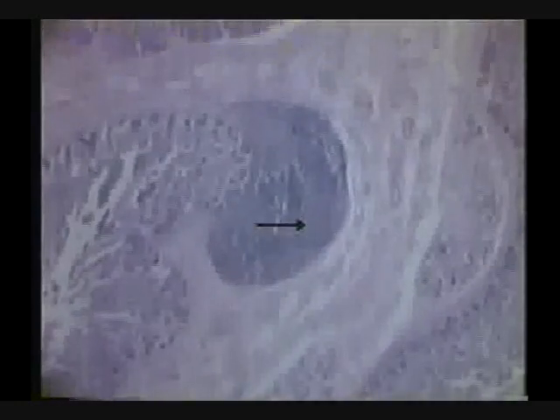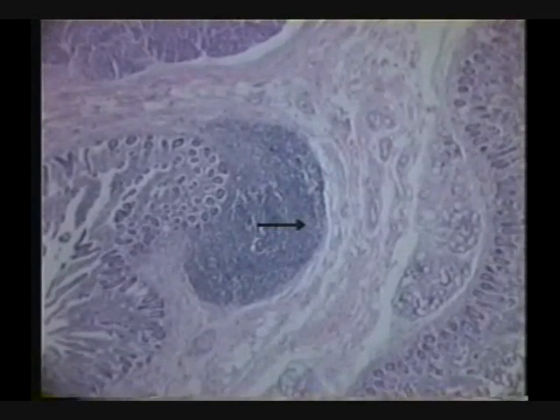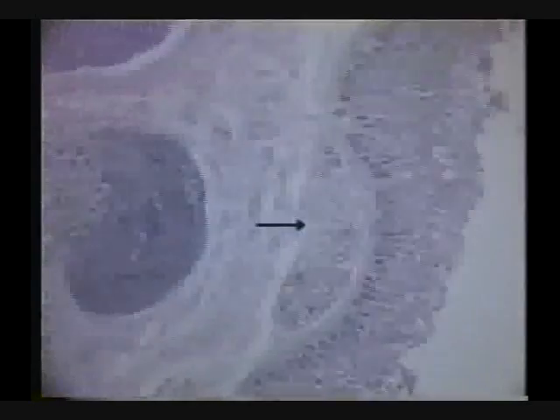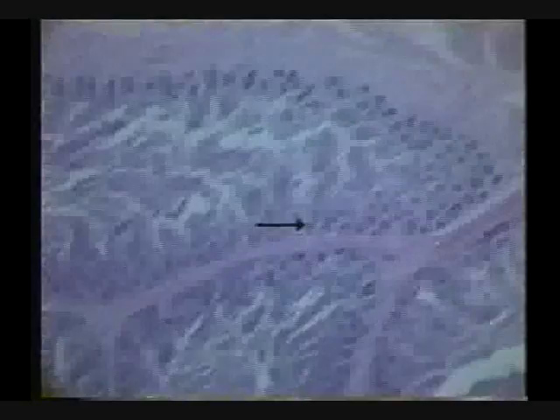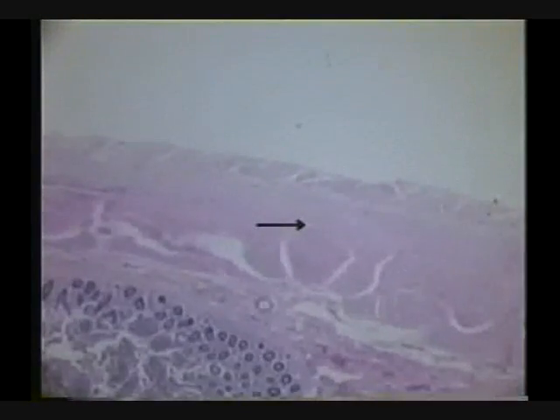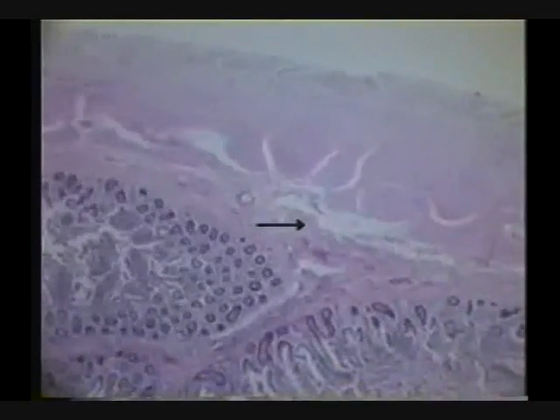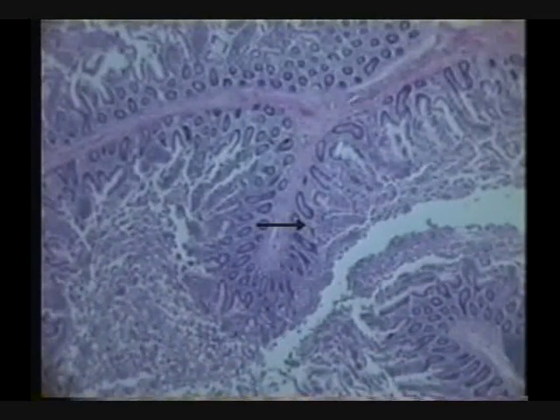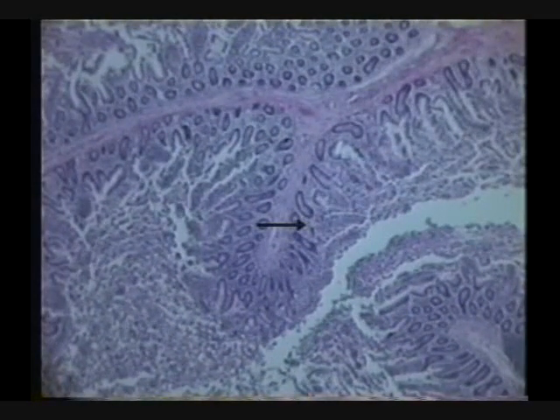If we go back and look, okay, see here's more duodenum. It's all fallen apart. Ooh, what's that? I hear it? Lymphoid nodule, isn't it? Okay, here in this piece of duodenum. And I go over here. Now here we move to jejunum. Okay, muscularis, submucosa. What is this structure coming out here? I hear it. Plicae circulares.